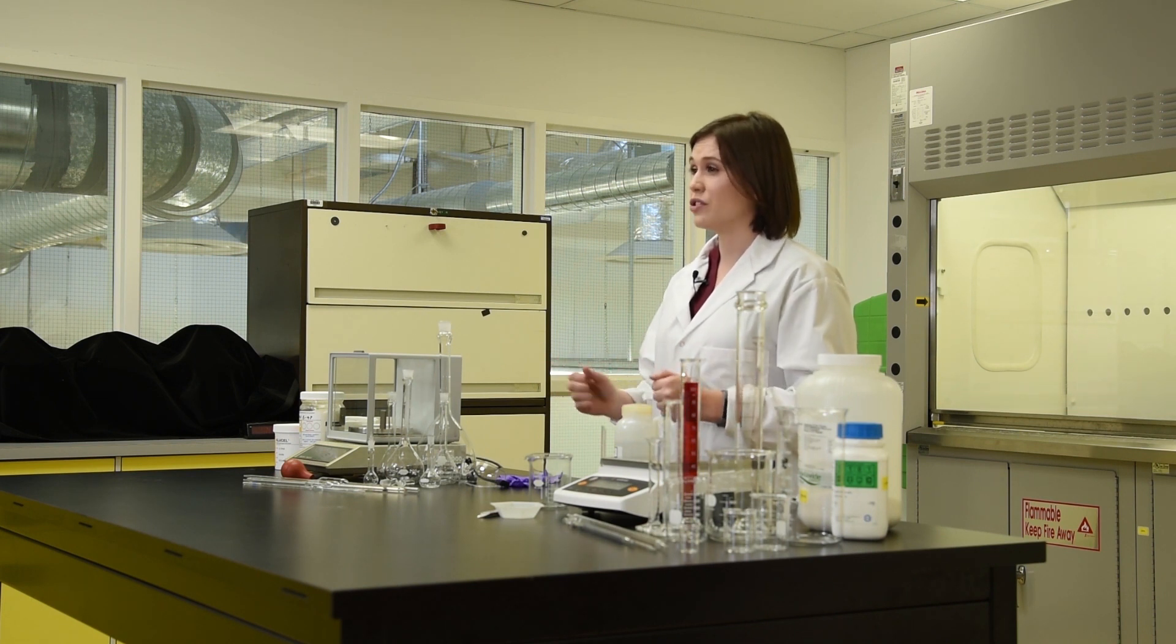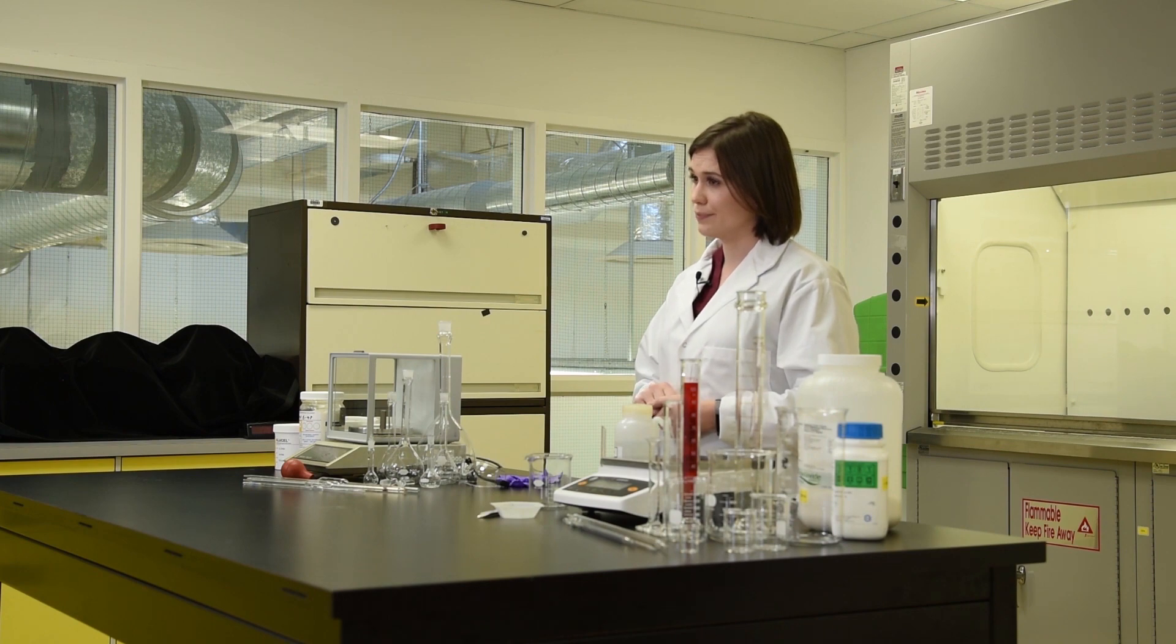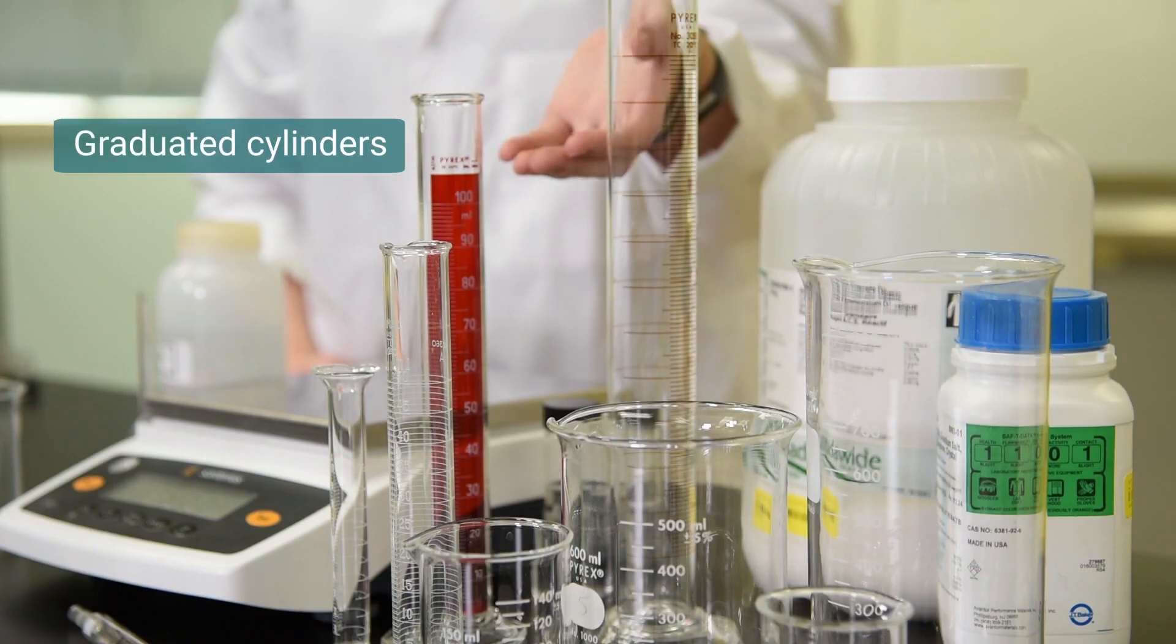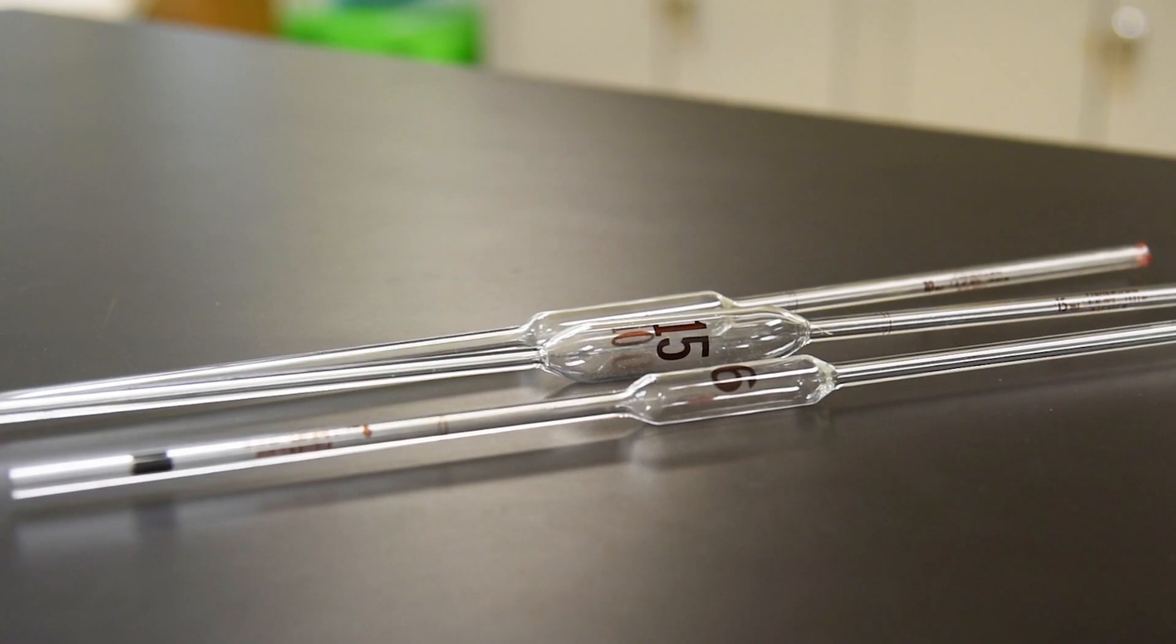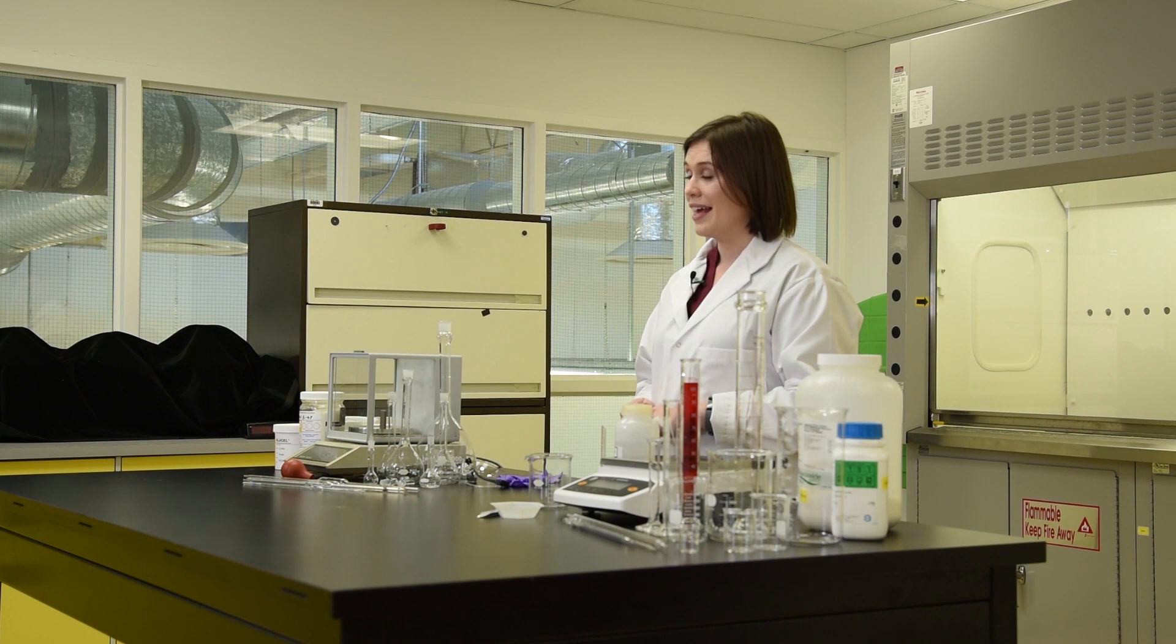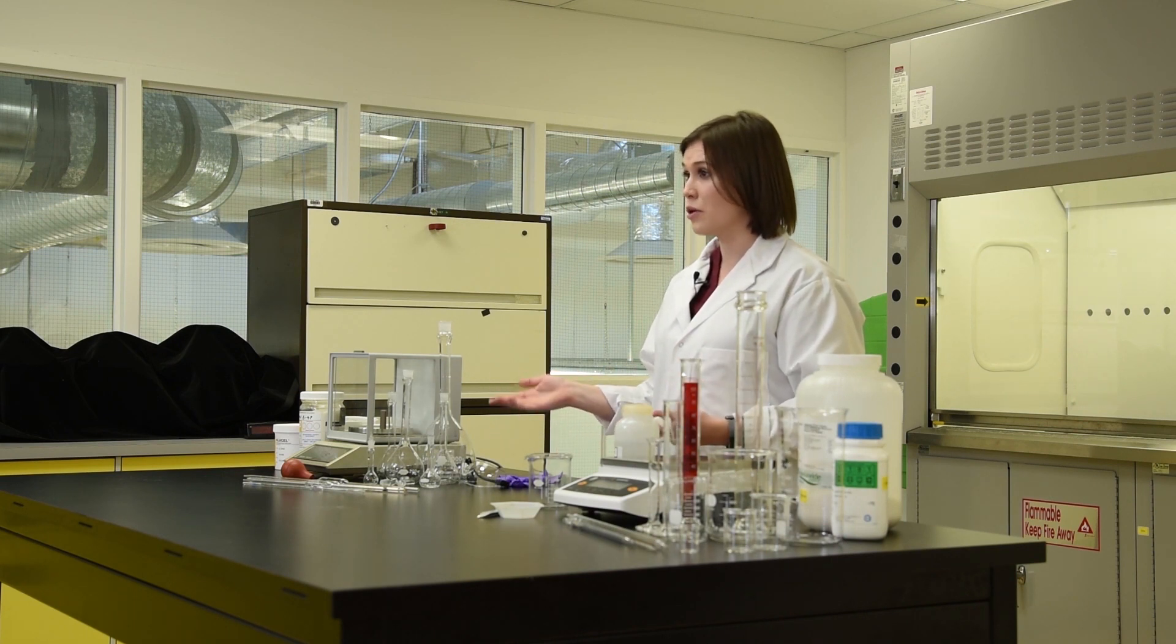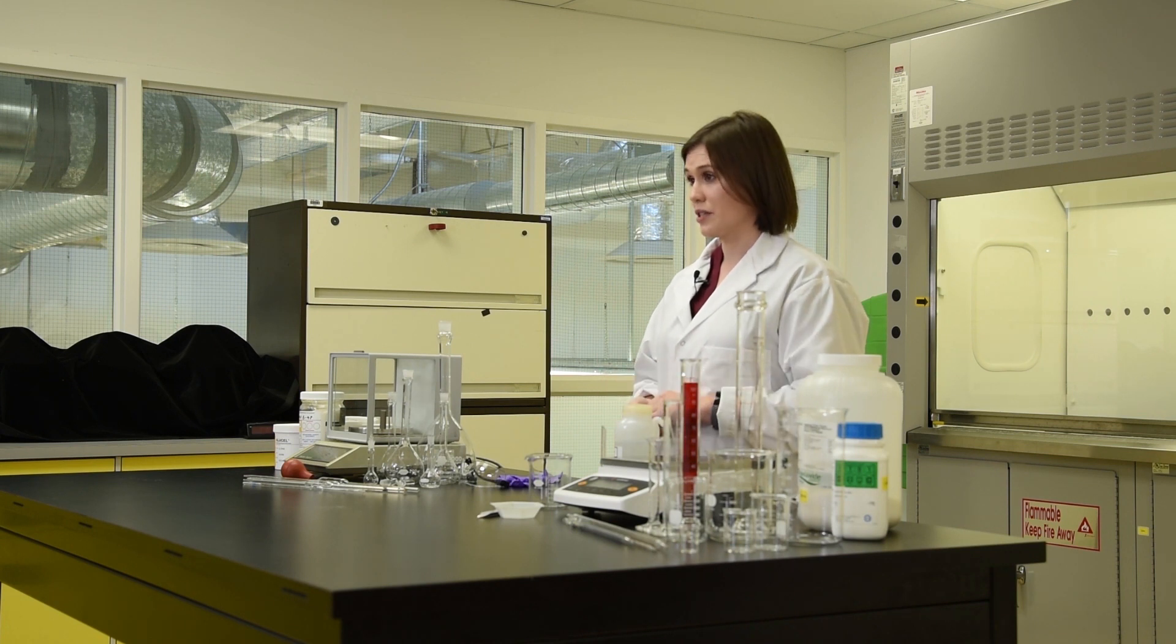It's also important to select the proper glassware. Beakers, graduated cylinders, graduated pipettes, volumetric flasks, and volumetric pipettes are all examples of common glassware found in conservation labs. As a general rule, volumetric glassware is the most precise for measuring volumes of liquids, whereas beakers are the least precise.